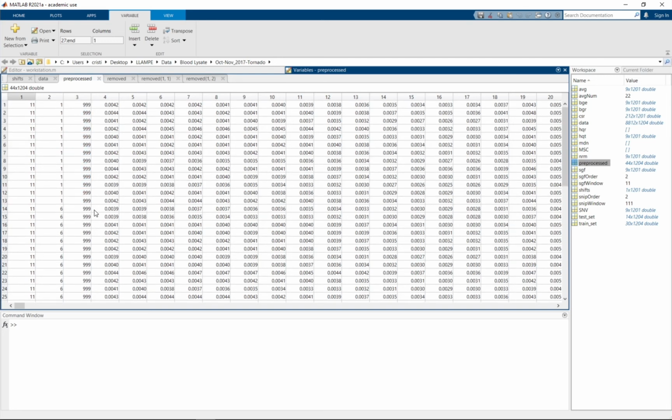Now there are a few things to notice. First of all, the doses have been added with a 1. So for example, all these 1s here are actually 0 gray, but 0 plus 1 is 1, so that's why we have a 1 in the second column here for 0 gray. And then all these 6s are actually 5 gray.